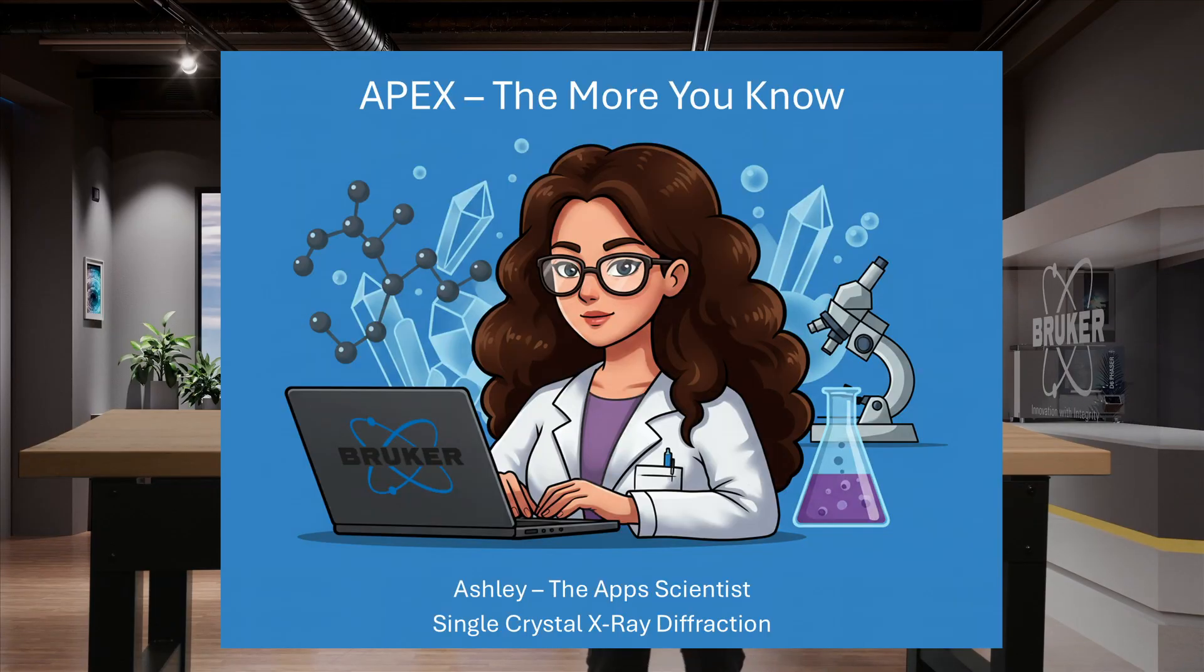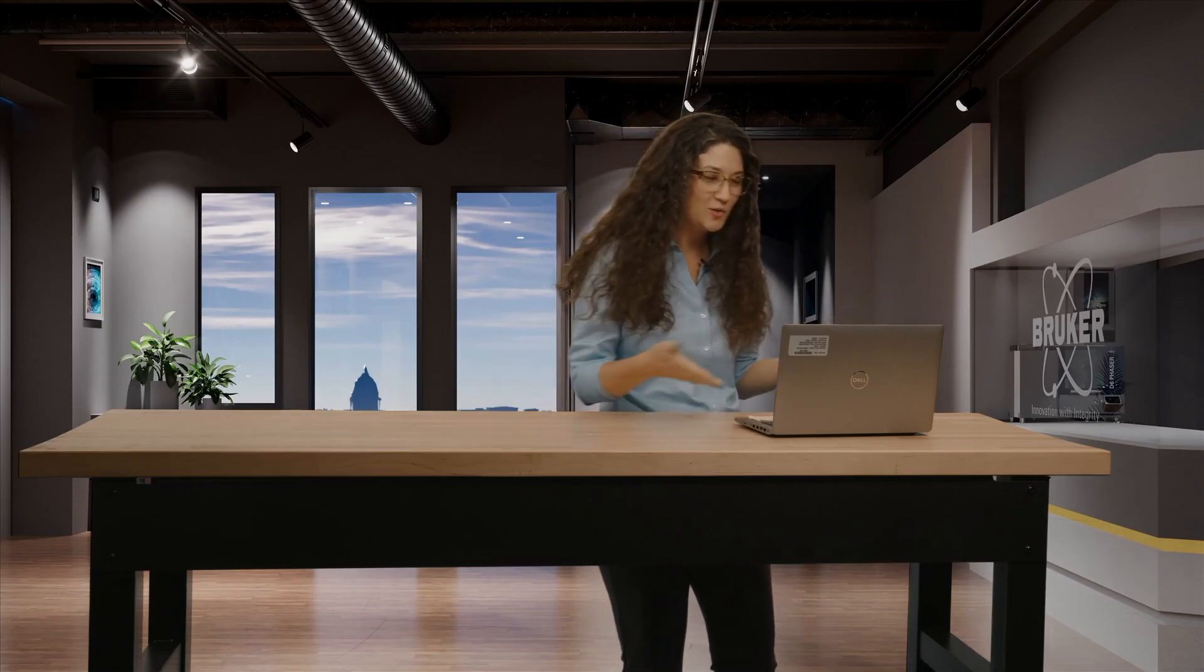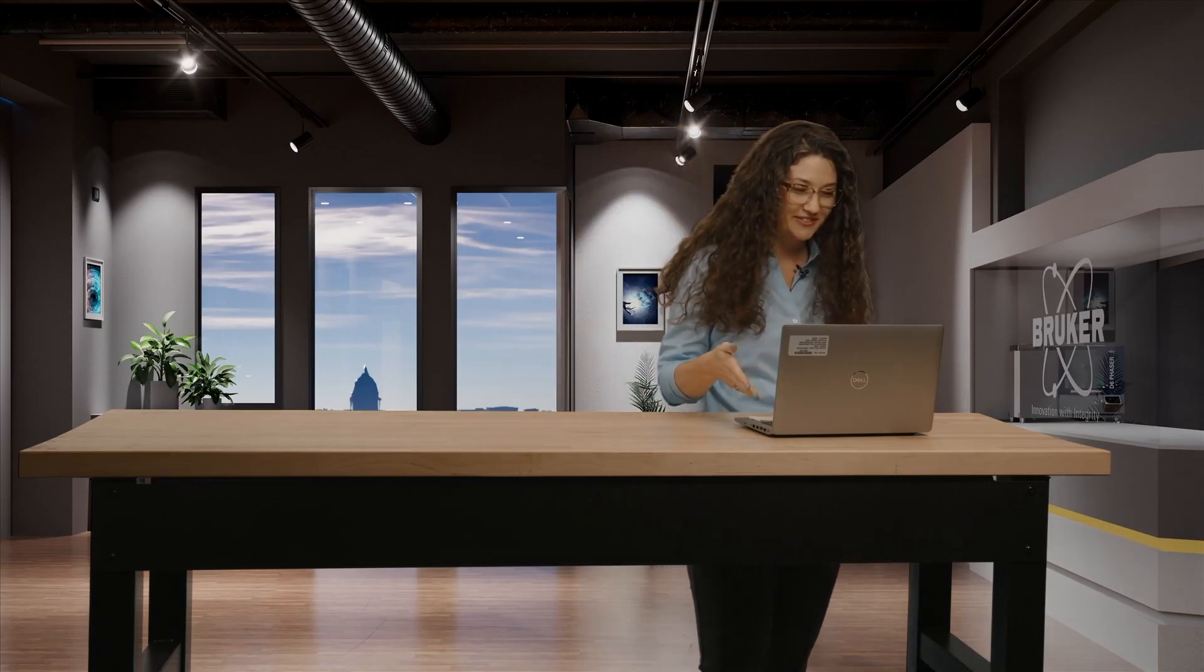Hi everyone, I'm Ashley the App Scientist and welcome to APEX The More You Know. Today we are going to solve a structure from just three minutes of data collection. How can you do that? I'm going to show you step by step.